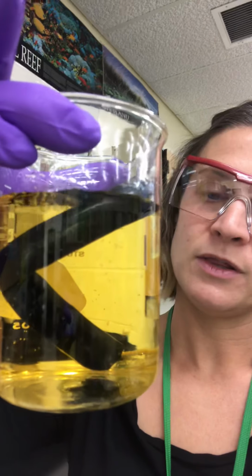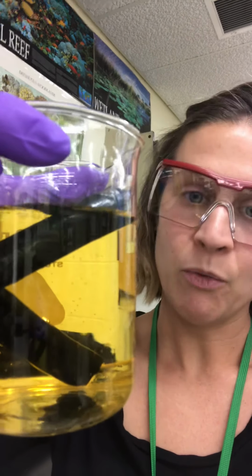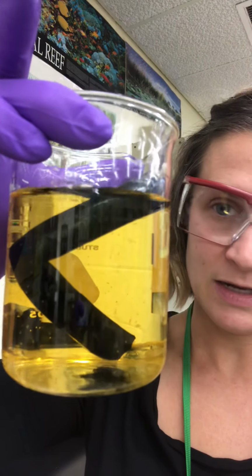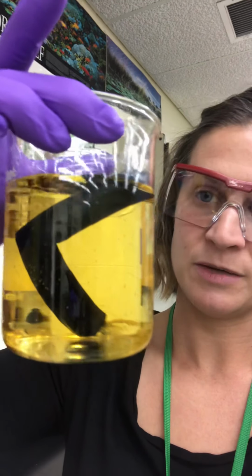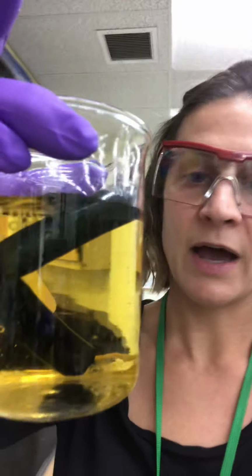So the iodine is still in the beaker, right? But what has happened? Where has it diffused? Well, it's gone into the bag. And how do you know that? Because the bag has turned black. So remember, iodine is an indicator for starch. So the iodine diffused into the bag.